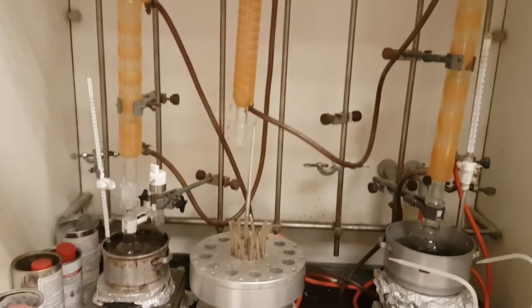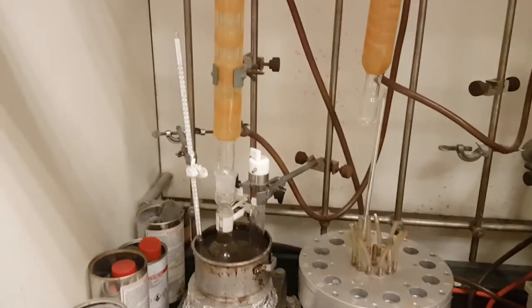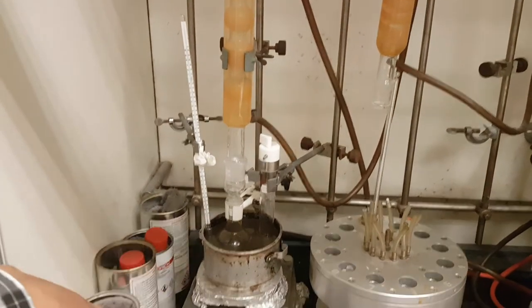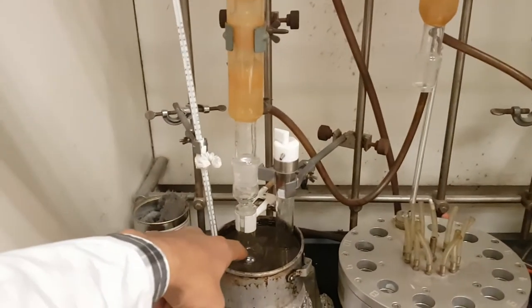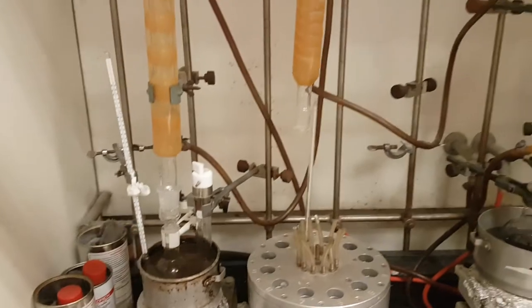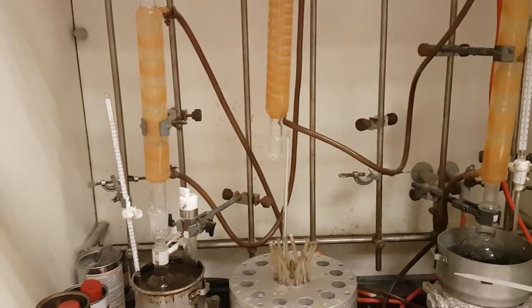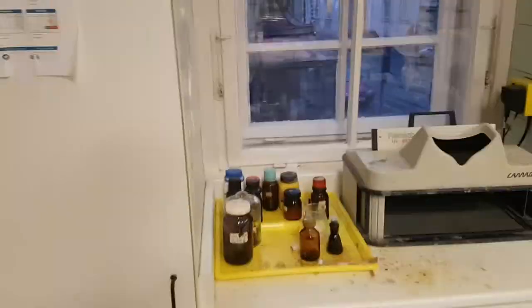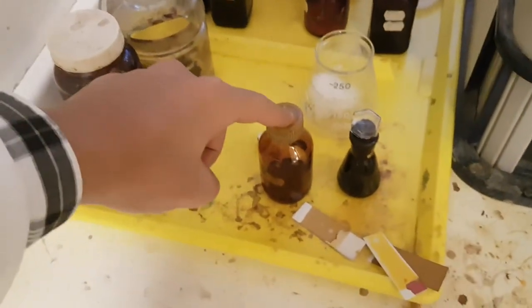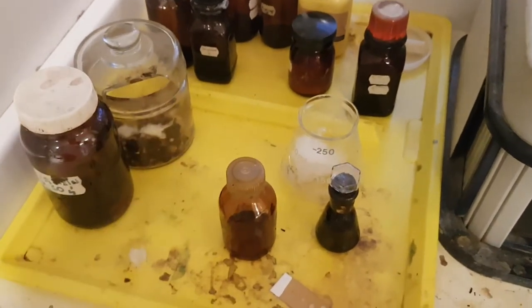While you are running a reaction, after a while you need to monitor its progress. You need to take a spot from your flask, spot it on the TLC, and see whether the product you are looking for is formed yet. Here you might use the Dragendorff reagent or potassium permanganate to monitor whether you have the amine function that you are looking for.